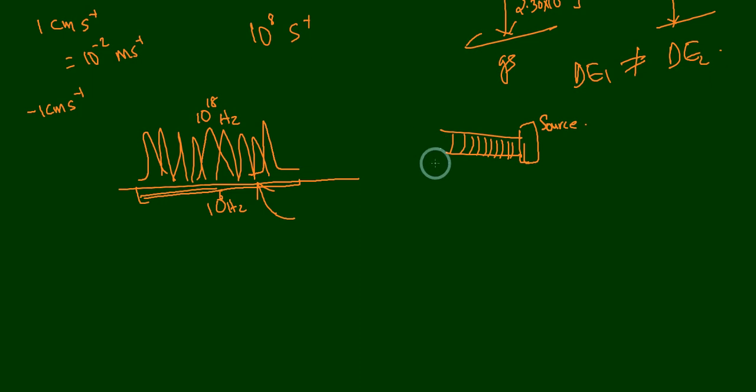If it is rotated in the clockwise direction, then this will move towards here. If the screw is rotated in the anti-clockwise direction, it will move backward, right? You already know this.